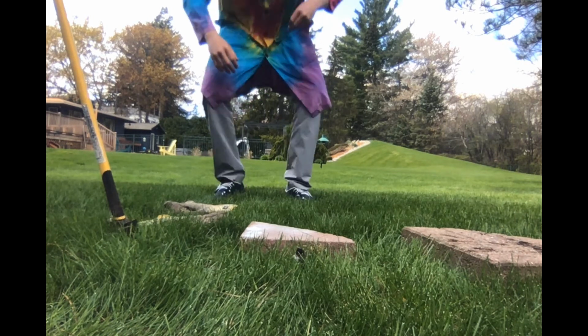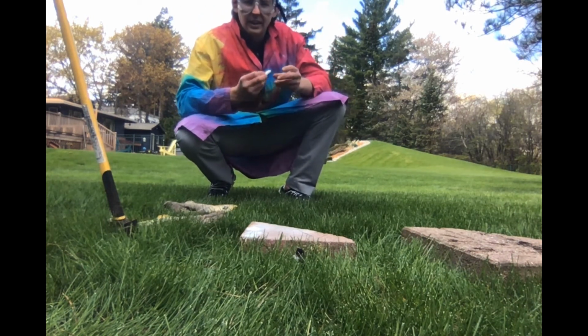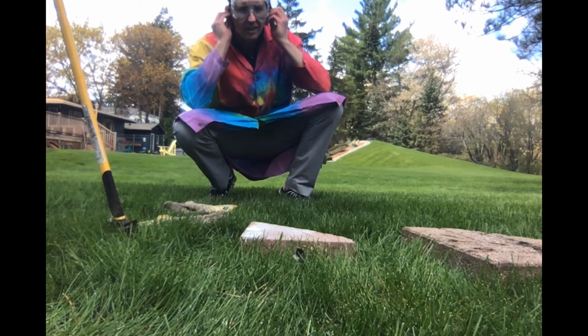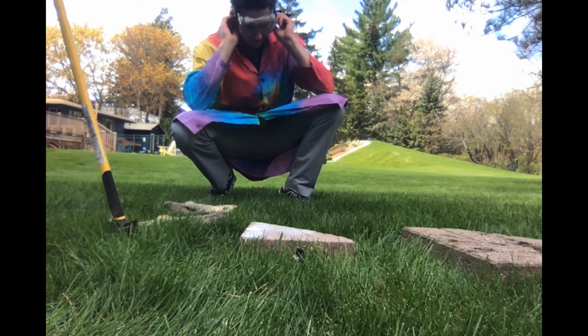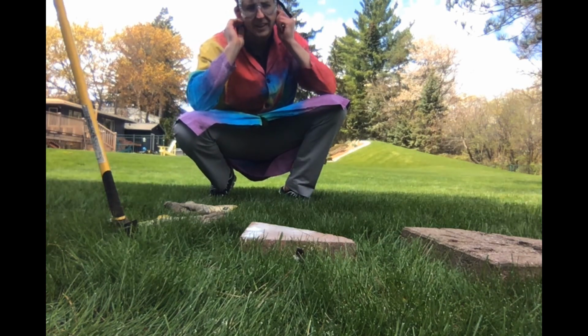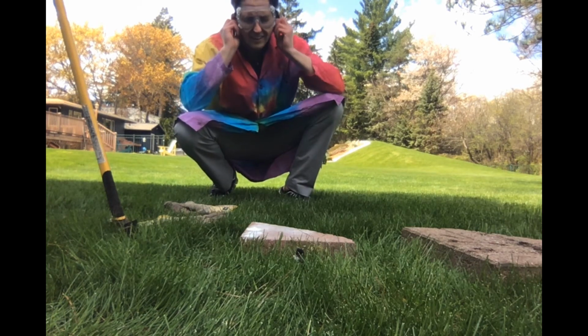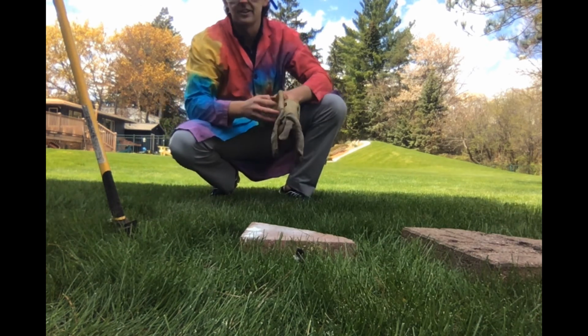All right, and in order to be safe, as Mr. Sulini said, you need earplugs. So I'm going to put my earplugs in. Can you hear me? What? Huh? All right, sounds about right. Can't hear anything.